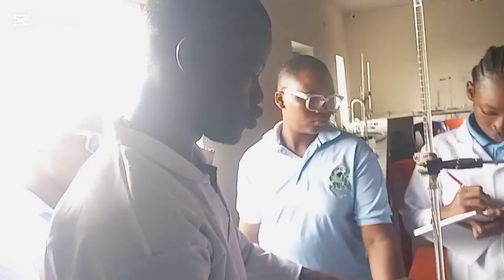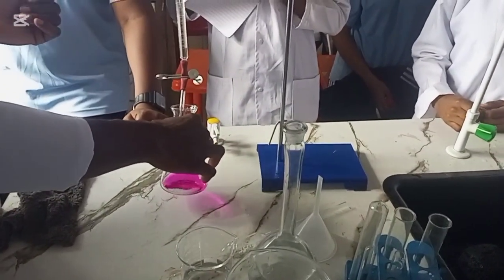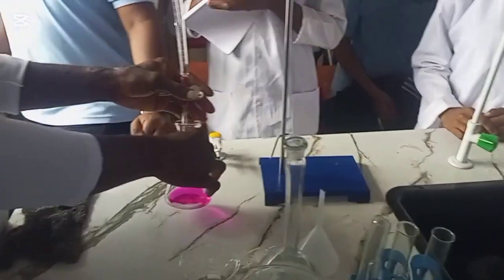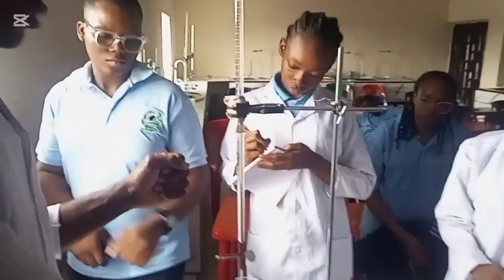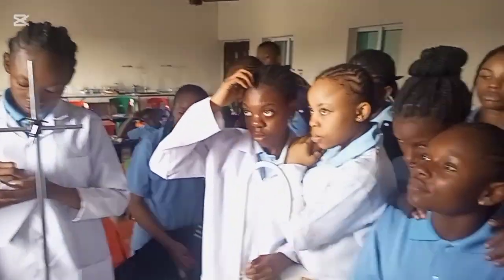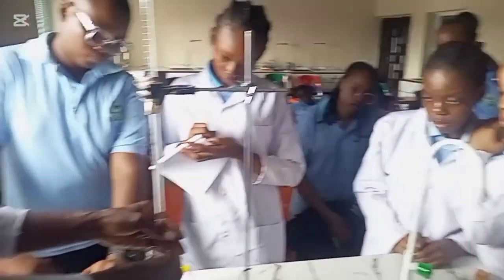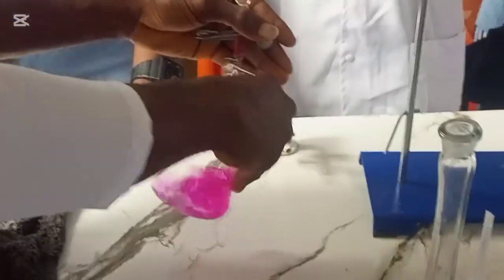Okay, we are going to do this all alone. During your time, you will be shared into groups where somebody will be in charge of opening and closing the tap. You open it just very briefly and you rock the flask as fast as possible. I have not opened it yet, but the way we do it, you may not even know when I open it.